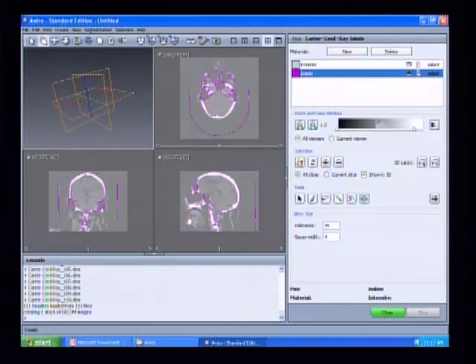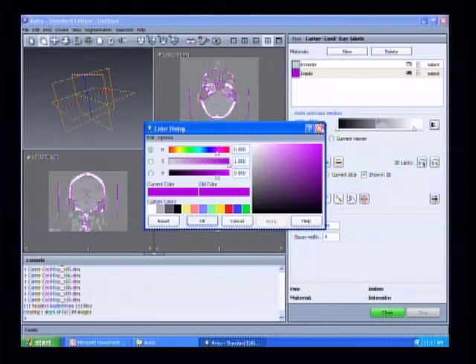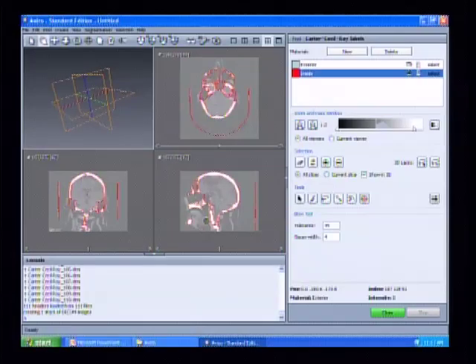You can also change the names of these if you want, when you have multiple materials. You can also change the color if you wish. Red is sometimes easier to see against the gray background, so maybe that'll help on the screen.